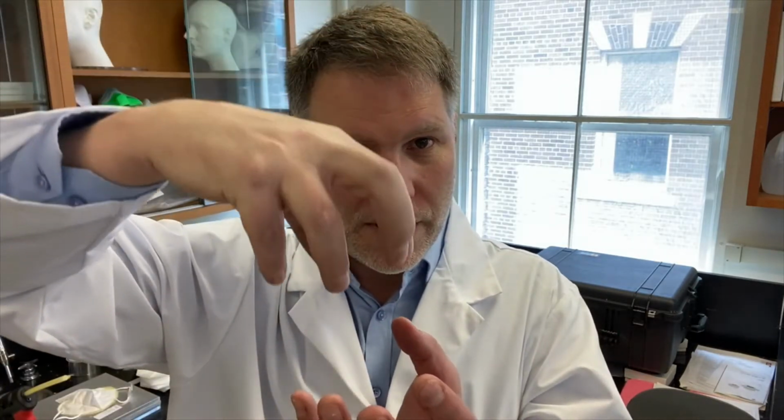There's a third device that we use, although I'm not going to show that because we've actually scavenged some of the parts for it in order to test graphene particle shedding from other types of masks, but I'll describe it. This mask tests bacterial filtration efficiency, and bacterial filtration efficiency is a test that's commonly done with medical grade masks. It takes an aerosol that contains bacterial cells and it moves them through a mask, measuring the concentration of bacterial cells in front of the mask and comparing that to the concentration of bacterial cells that get through the mask.